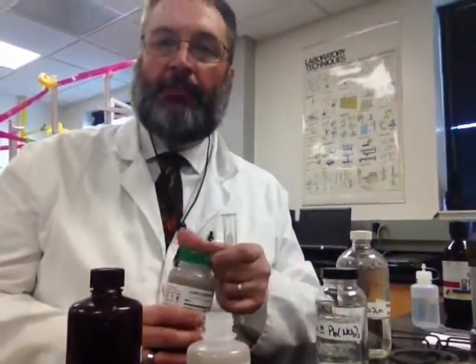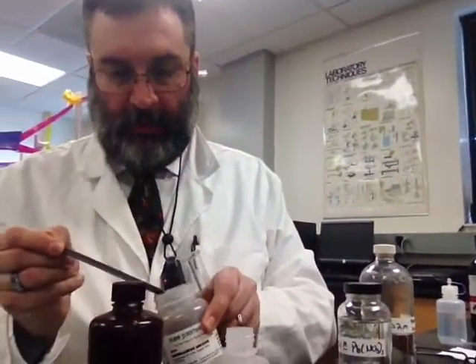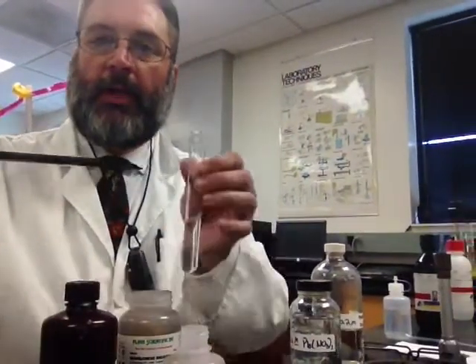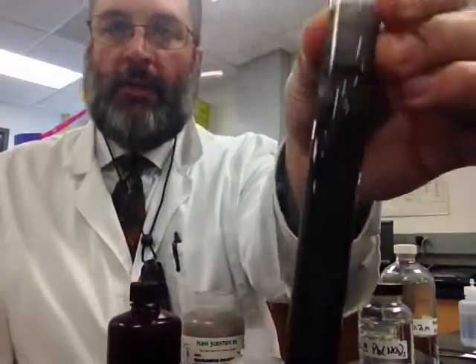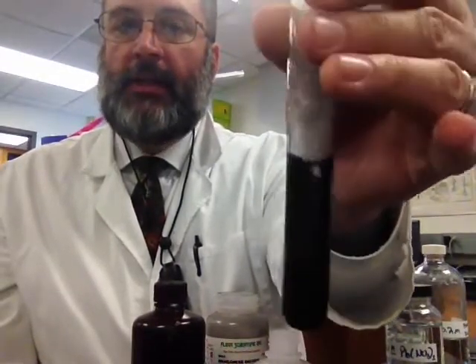MnO2 is a blackish powder, and I don't need very much of this blackish powder. Just a tiny little bit should do it. About that much of the powder should work. Now when I add this, it's going to speed up the decomposition, and you should be able to see the bubbles. You can see the bubbles forming. That's your oxygen gas. Okay?